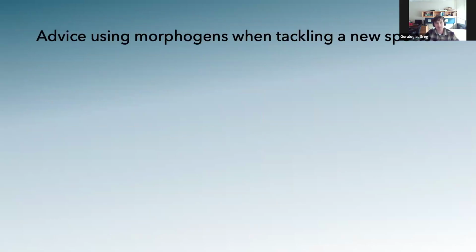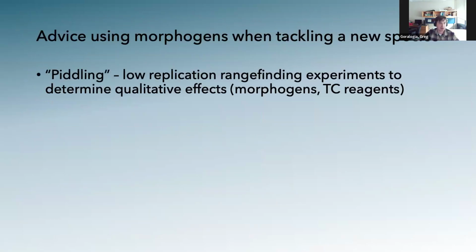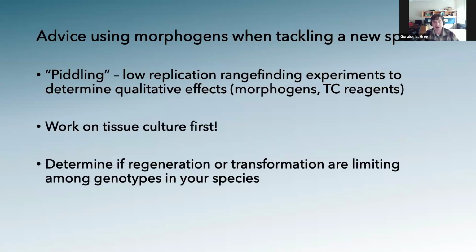A couple of points of advice from my learning. I like to piddle. I like low replication experiments that look for qualitative effects, like help you read the tissue culture, see which ones are providing a beneficial effect before you commit to some huge experiment. Work on your tissue culture. It's very important when you're doing a new species.